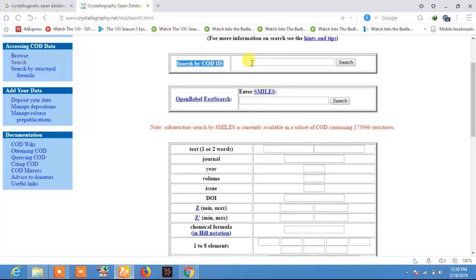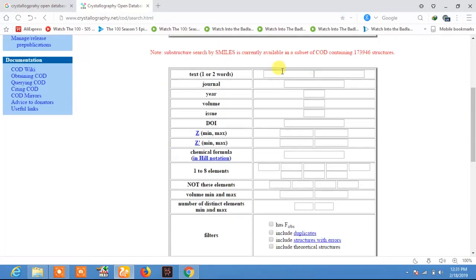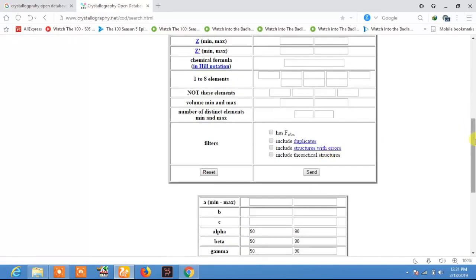The second method is to enter the mineral name. For example, if you are searching for any type of mineral like garnet, titanium carbide, or any other material, just type the name of that material or mineral here and click Send, and you will get some results.